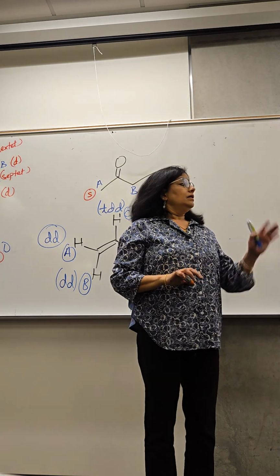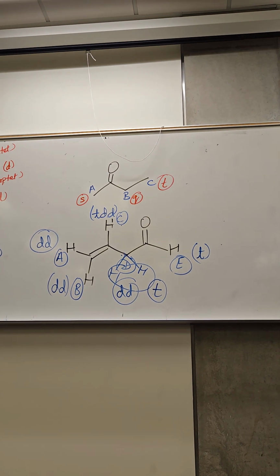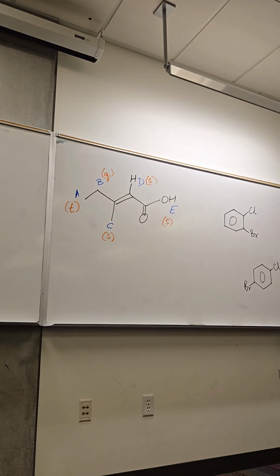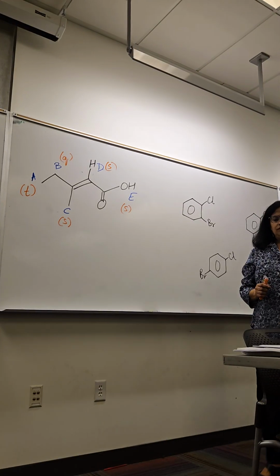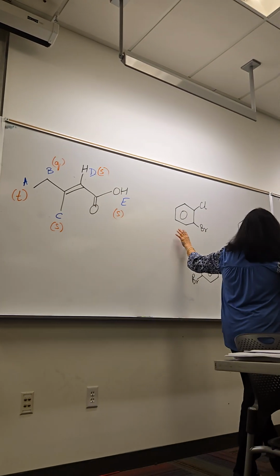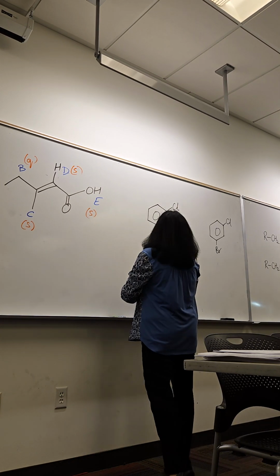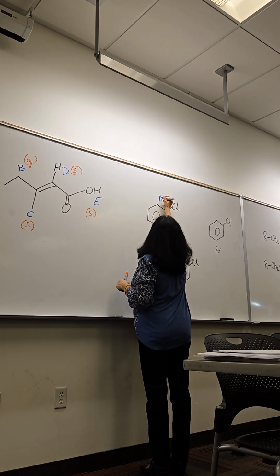Yep. Let's go to the 3 benzene structures here, just for a better understanding of benzene. Benzene is the only time we will go more than 3 sigma bonds, 4 sigma bonds, basically. So how many signals for this structure? 4. I heard 4. Because it's not symmetrical, right?